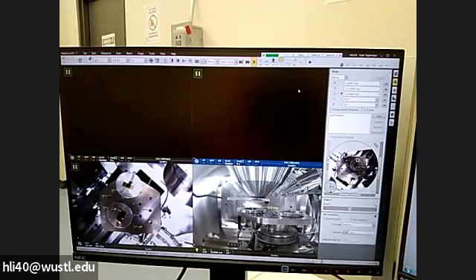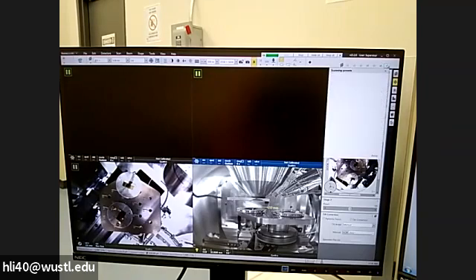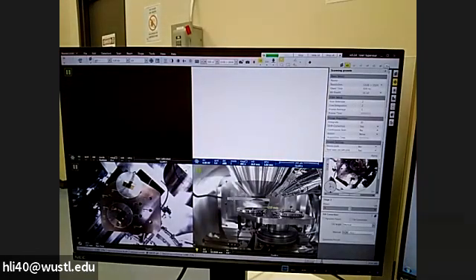All right. So on this side, we have some preset scanning speeds for you. S1 is fastest, S6 is slowest. You can also change this by clicking, for example, S1, and then I can change the preset value. This is sometimes used for a sample which is sensitive to the beam. We will get some integration there based on what we want. Okay, we will play with it when we have time.